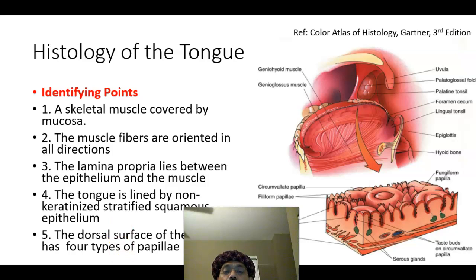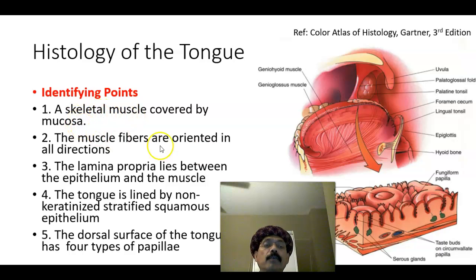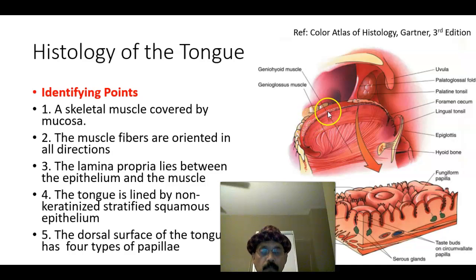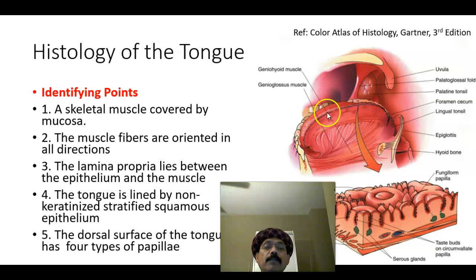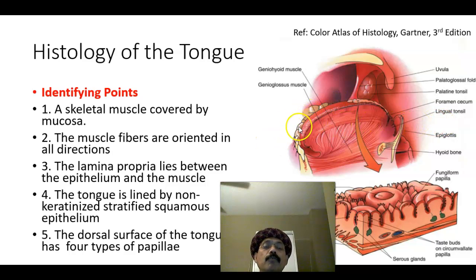First, we will go through the identifying points. We have skeletal muscle covered by mucosa. Muscle fibers are oriented in all directions. We have the lamina propria and the lining epithelium — these two form the mucosa. The lamina propria lies between the epithelium and the muscle. The tongue is lined by non-keratinized stratified squamous epithelium, with the exception of the tip of the filiform papillae, which is covered by keratinized stratified squamous epithelium.